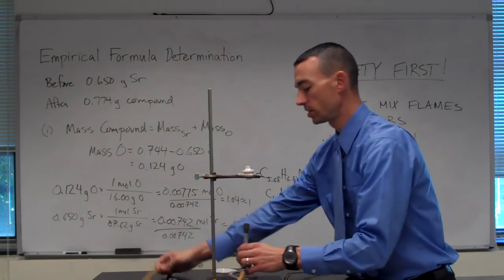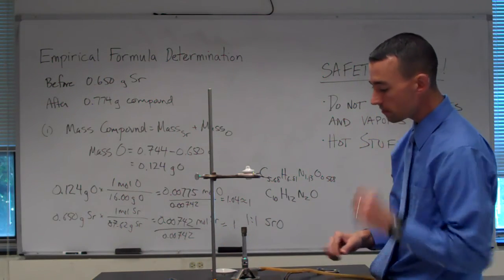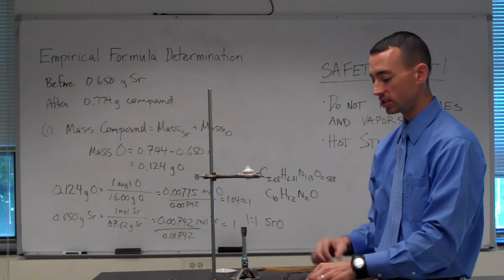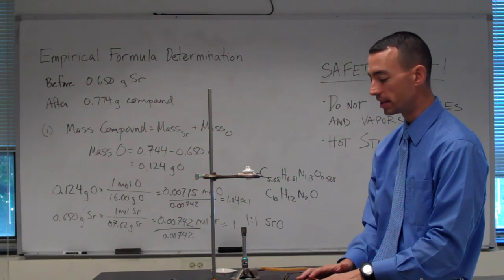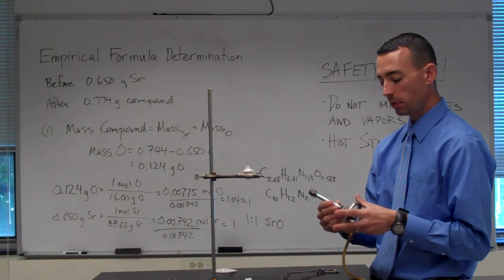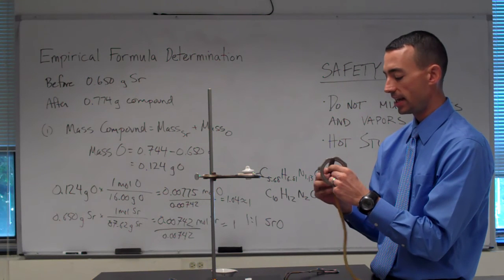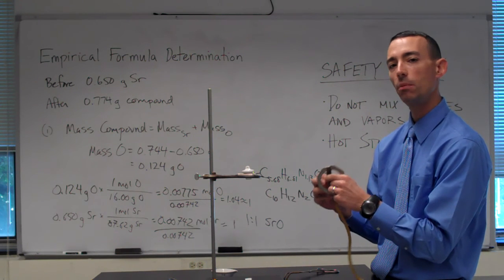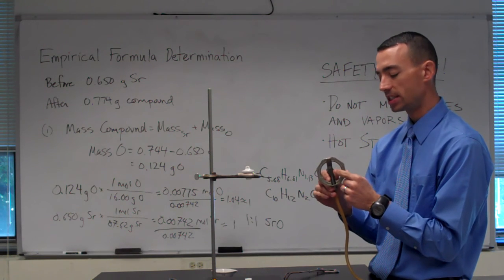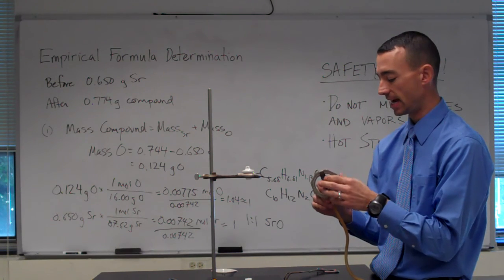Underneath the crucible, you'll be using a Bunsen burner. So for some of you, this may be the first time you've ever used a Bunsen burner. The Bunsen burners hook up via a hose to the gas jets on your lab bench or in the hood. So you simply push that onto the nozzle. The Bunsen burner is controlled by two methods. On the bottom of the burner is a dial or a knob that controls how much gas is allowed into the burner. This would just be the same as a knob on a gas stove turning up or down the gas.